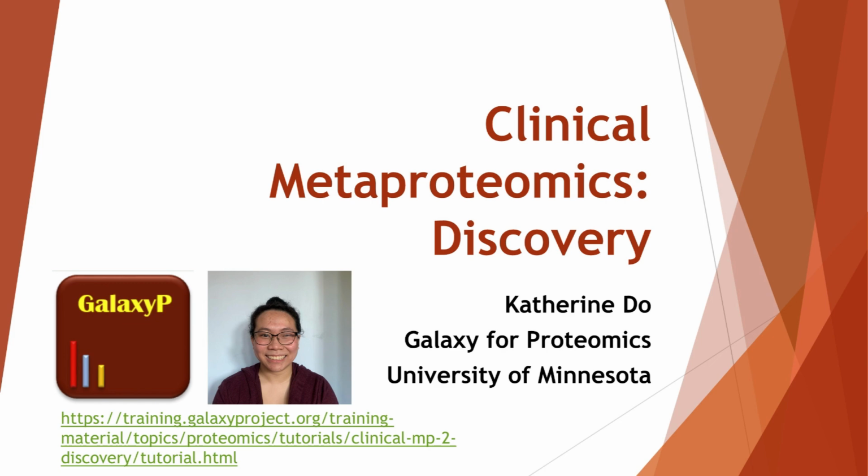If you haven't already, please watch the two videos preceding this one, which are the overview video and the video for Module 1 database generation. These videos provide helpful background and context to understand what we are doing in this video.